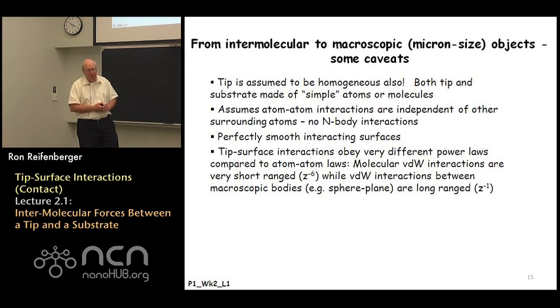So just a few comments to remind you that this is a model, and how well that model applies to a real physical situation depends on how well the assumptions of the model match the physical situation. One of the big assumptions, of course, is that the surface and the tip are perfectly smooth. It's really hard to achieve that experimentally, but clearly if you want to do these integrals, that's one assumption you have to put in. And it's possibly one of the shortcomings of these models that you never have a tip that's atomically flat. You'll never have a substrate that's atomically flat. So if you see deviations of experimental results from this theory, possibly that's one of the points that you have to worry about.